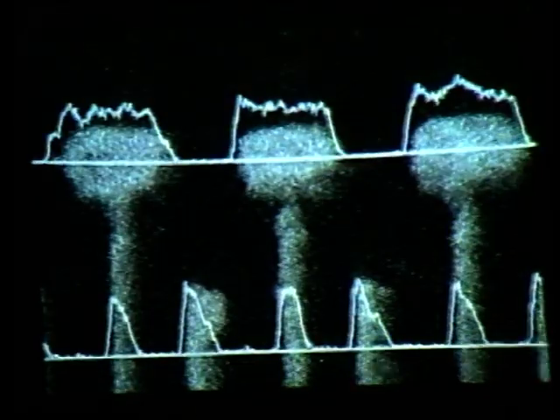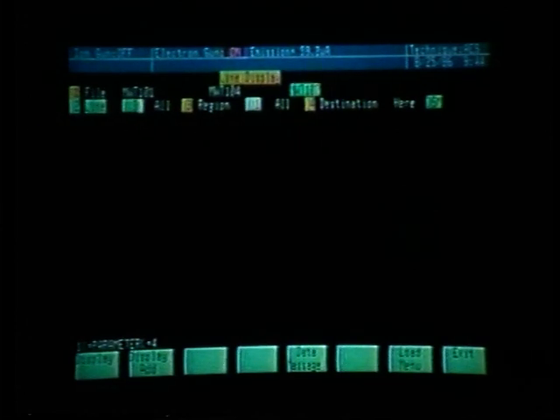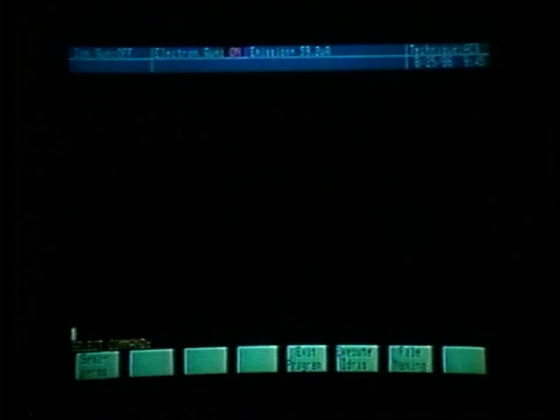At this point, we would like to take a photo of this. Going back to the terminal, let's exit from the line display menu, pressing soft key number 8. Let's enter our photo setup, shift and function key number 20.